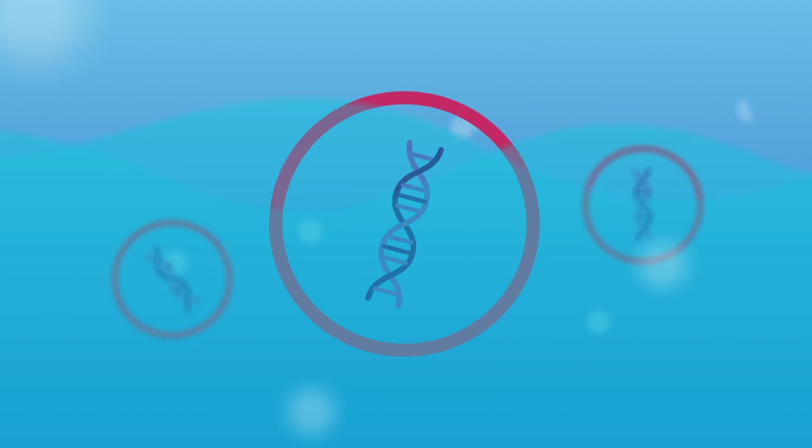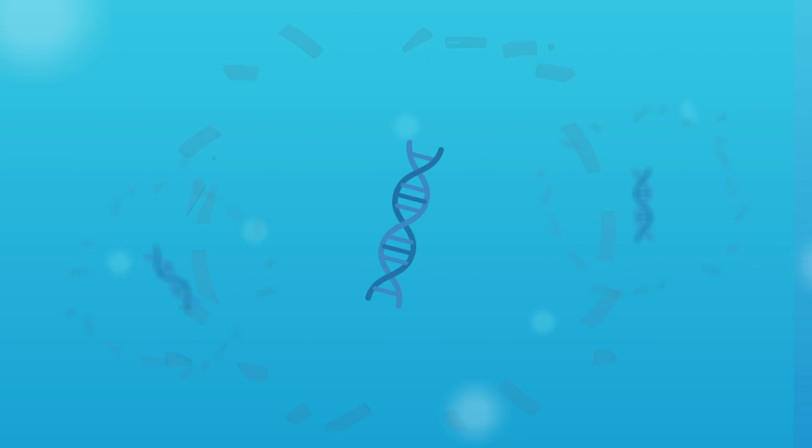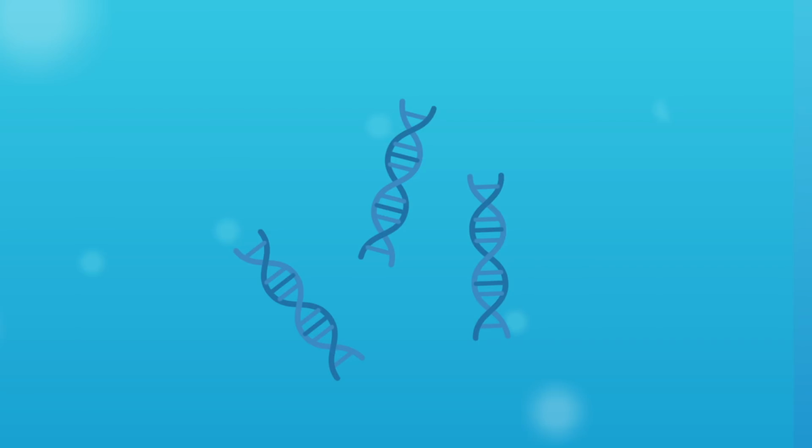in your saliva. The first thing we do is something that's a lot like cracking open an egg to get to the yolk. Except here we're basically using detergents to bust open all of the cells in your spit sample, freeing the DNA that's trapped inside. And we do a quick check to make sure there's enough DNA before we go into the next step called amplification. Which is just a fancy word for copying.